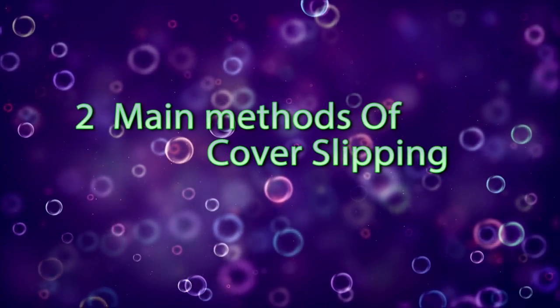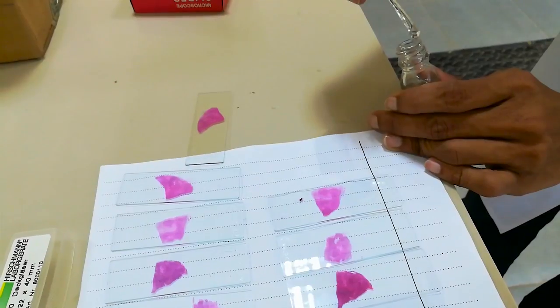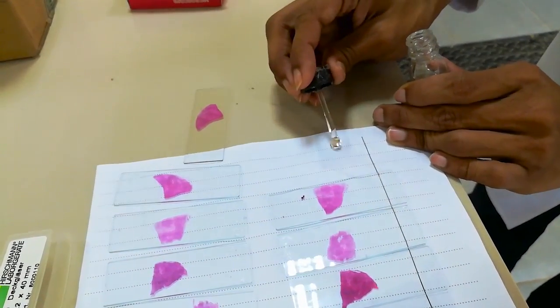There are two main methods of cover slipping. Method number 1: add one or a few drops of mounting medium onto the cover slip.